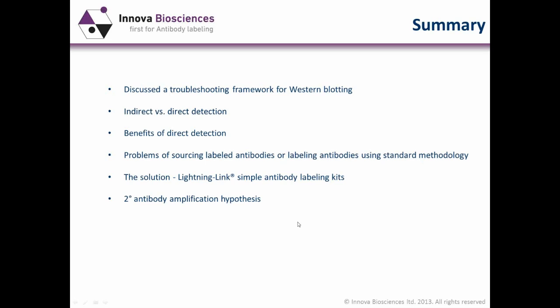We discussed the Lightning Link technology available from Innova Biosciences, and we briefly touched upon the secondary amplification hypothesis, which I hope will reassure you. As I said, if you eliminate secondaries, you're not necessarily eliminating the sensitivity of your system. And with that, I'm going to hand everything back to Claudina.